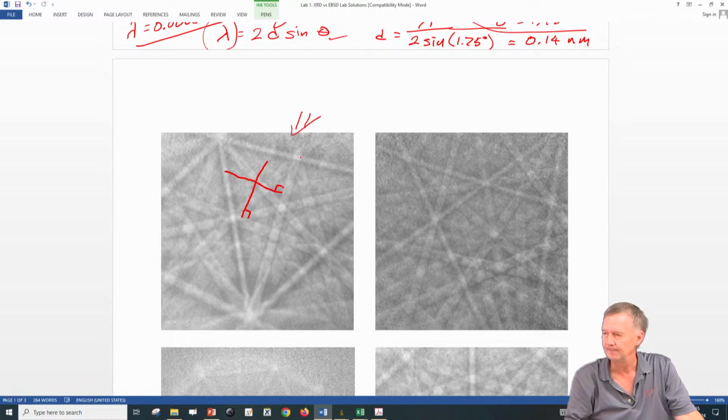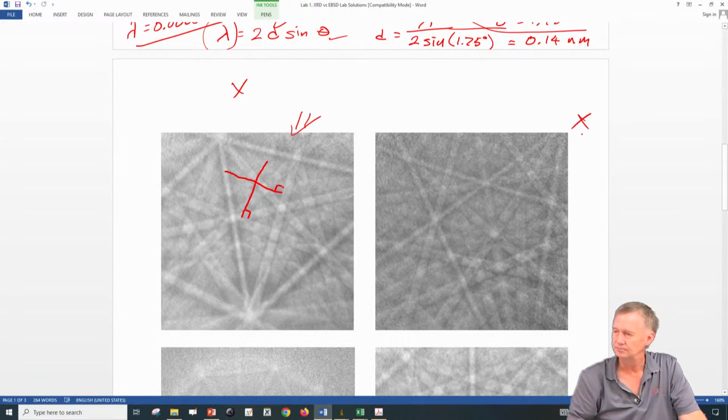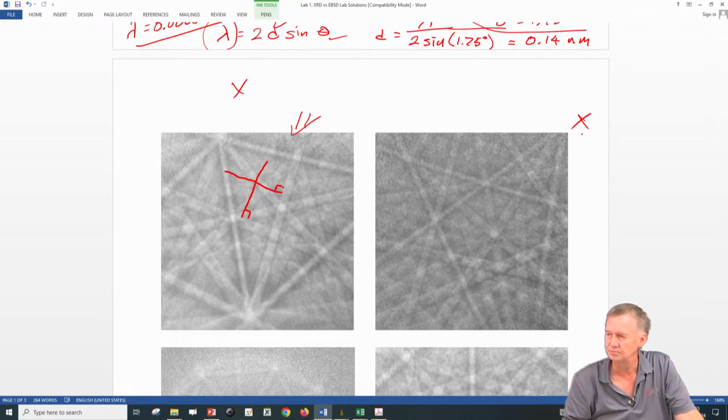It can be outside, absolutely, yeah. Pattern center could be way up there or way over here somewhere, because the bands go narrow. It can absolutely be out of the field of view of your image. If the pattern center is out of the phosphorescence screen, could we still get the Kikuchi lines? Yes, you can get good diffraction.